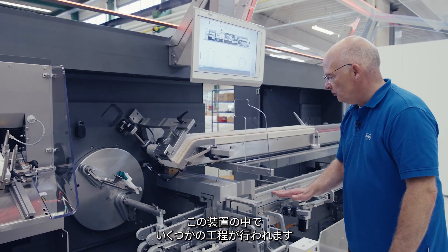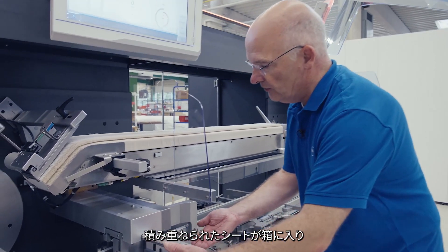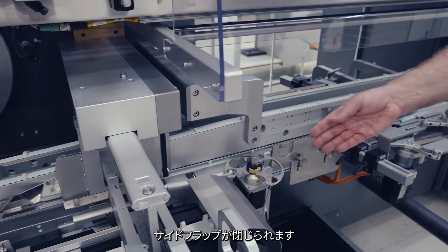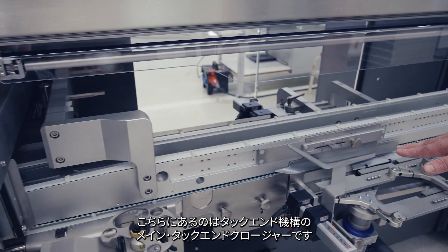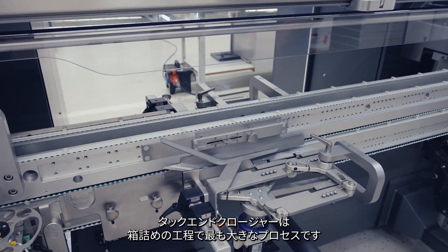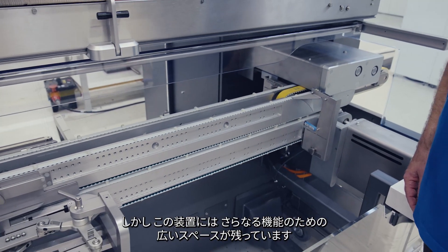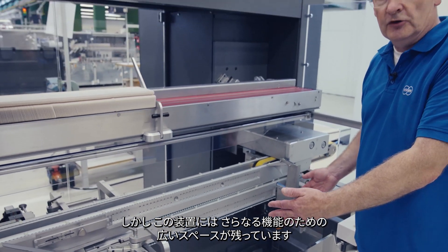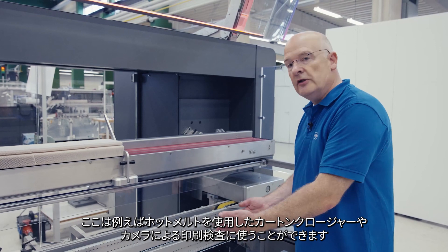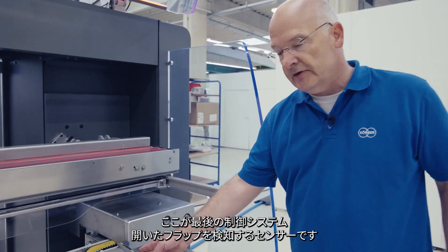Throughout the length of the machine, several process steps happen. The built stack is inserted into the carton, side flap folders close the side flap, followed by the main tuck-in closer for the tuck-in mechanism. Tuck-in closing is the most common carton closing style, but plenty of space is left free in this machine for further features — such as a carton closer with hot melt, or printing with print inspection by camera.